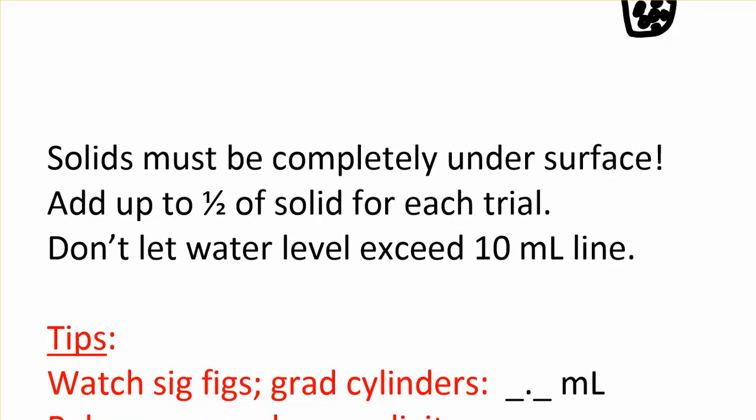You need to watch your significant figures. When you use that balance, write down every digit it gives you. When you use your graduated cylinder, they're kind of different. Our graduated cylinders aren't marked every tenth. So let me show you. Like this. So when you read that off, say that's our meniscus, we know that this is 9 point something. What is that little line there?